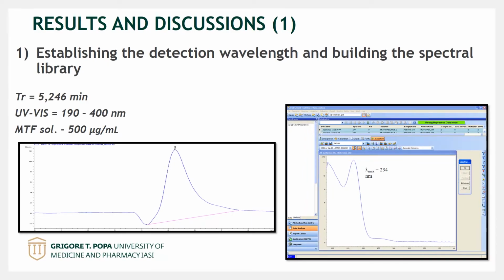From the analysis of the absorption spectrum obtained for the standard solution, a maximum at the wavelength of 234 nanometers is observed. For all determinations performed in the validation or practical applications of the method, the wavelength of 235 nanometers was used.